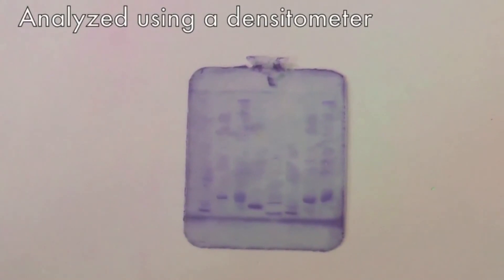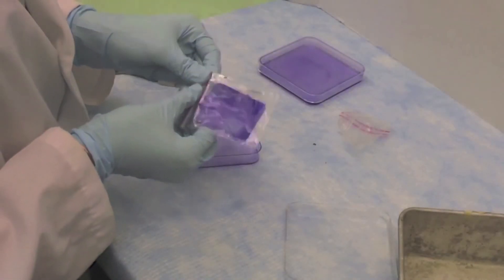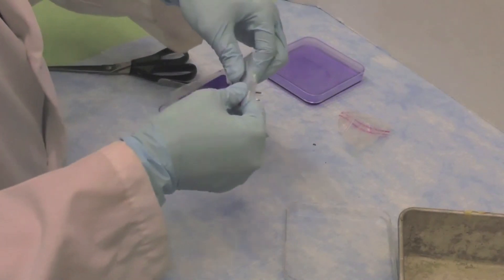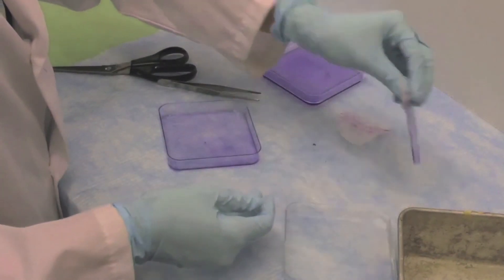When the gel has completed de-staining to a transparent background with distinct blue bands, scan the gel and analyze using the densitometer. The gel can be kept by replacing the plastic cover on the gel, then stored in a small ziplock bag.